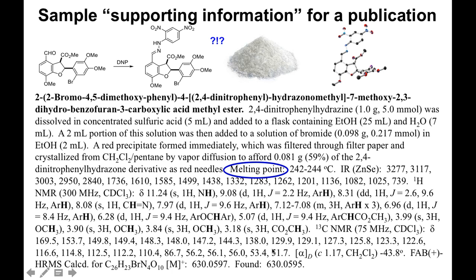The one we're going to look at in this lesson is called mass spectrometry. And mass spectrometry uses the molecular mass of a substance. It actually determines the molar mass of something. And then that helps us figure out what the molecular formula might be. And that really starts to indicate what its structure might look like.